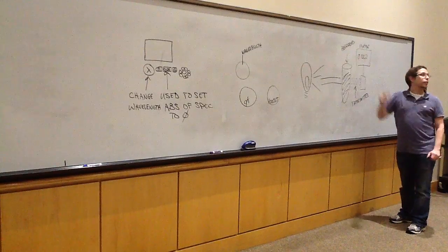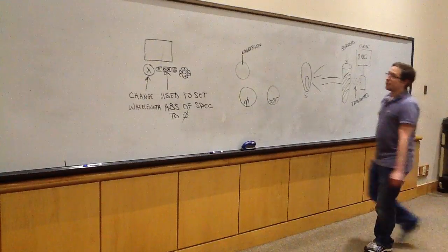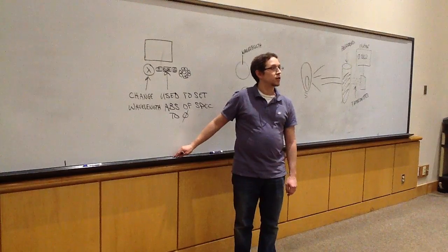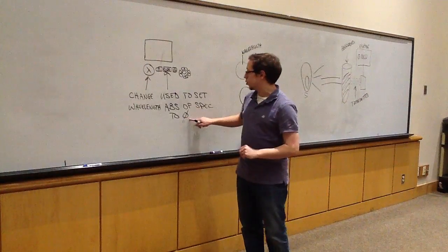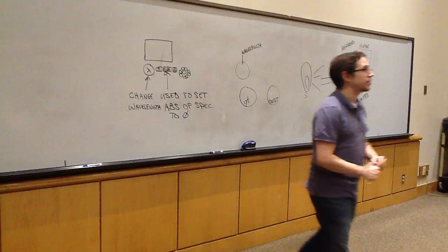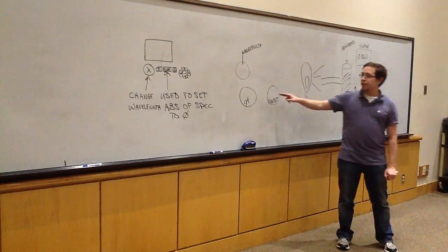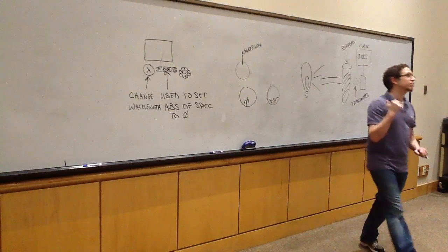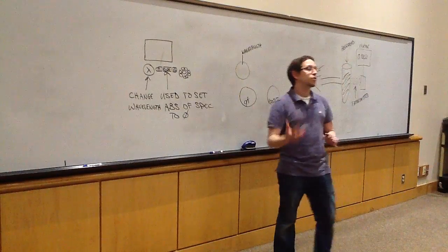We're using absorbance and we're using transmittance with the spectrophotometer to tell us something. All right? Now, for those of you who came here to Spring Creek campus, essentially what you did when you placed your blank in here was you set the absorbance to 0, and we're going to talk about what that means. While those of you who went to Central Park and PRC, you probably looked instead at your percent transmittance first, and then your absorbance. So when we start talking about the blank, I'm going to talk about how absorbance and transmittance are related to each other in that regard, to kind of get you thinking about that.